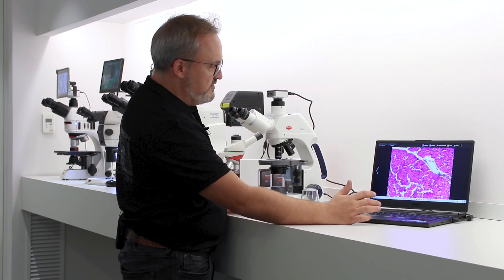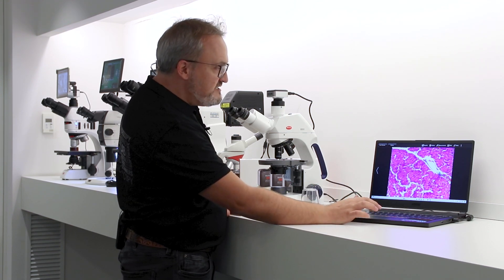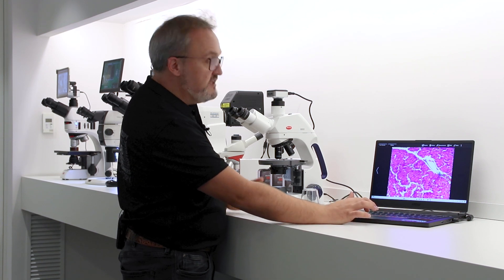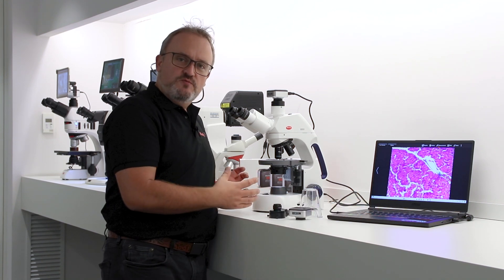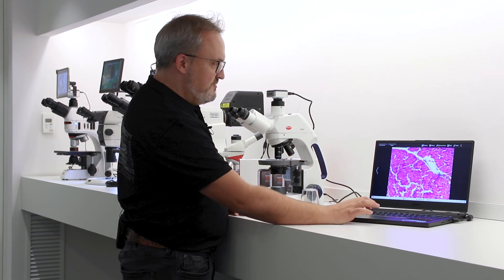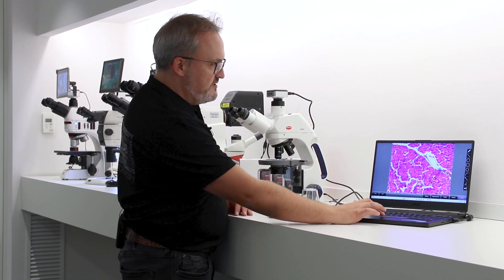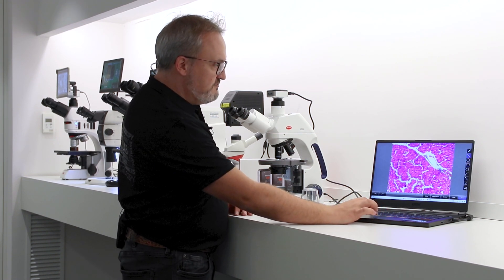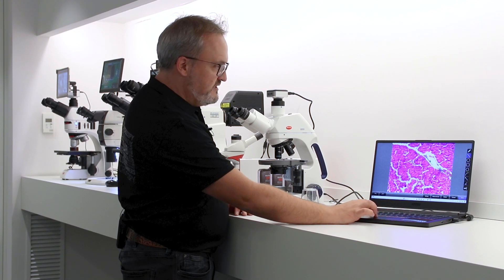I can annotate and more importantly after calibration, and part of the all-in-one box is that you get a calibration slide, meaning that your measurements will then be accurate. So with this simple software I can capture the image and then I can start measuring.